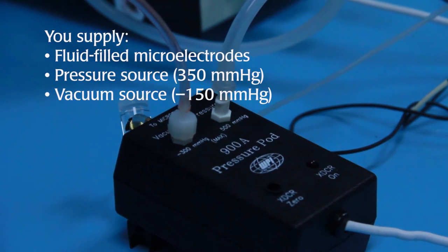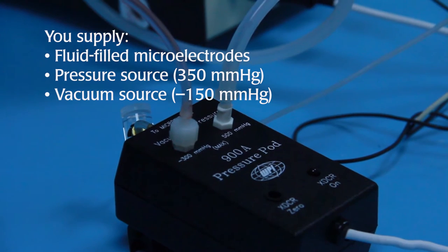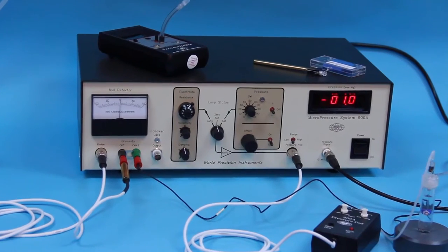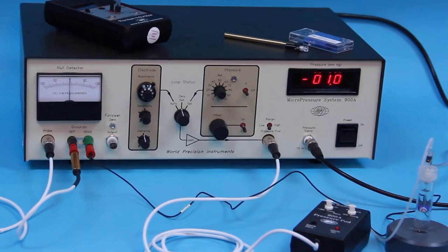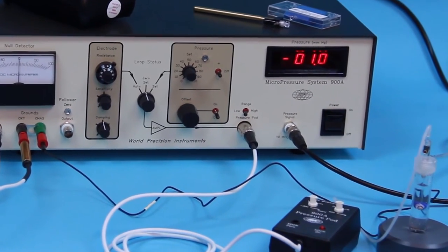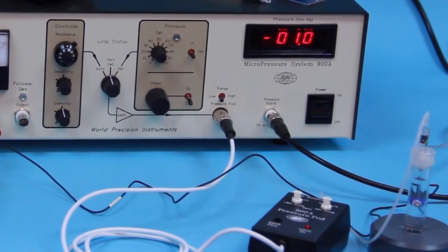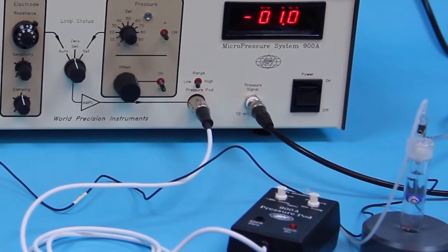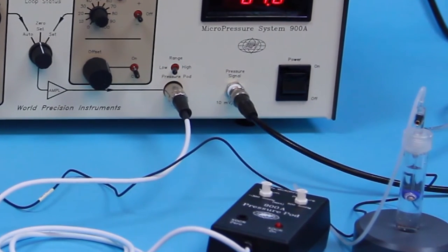You simply supply fluid-filled microelectrodes, a pressure source, and a vacuum source. Measuring electrical potential and pressure simultaneously lets you use potential recording as an additional cue for locating the electrode where visibility is limited or correlate pressure and potential when this is meaningful.